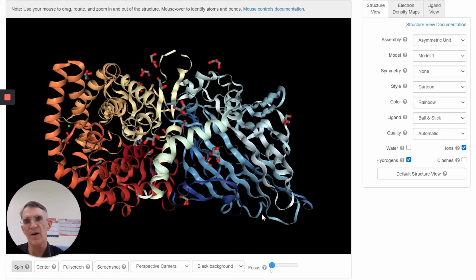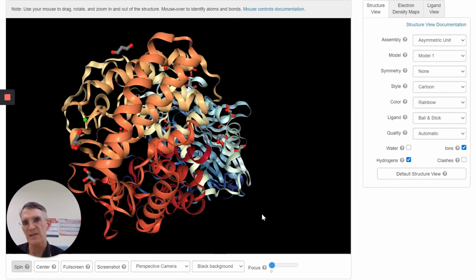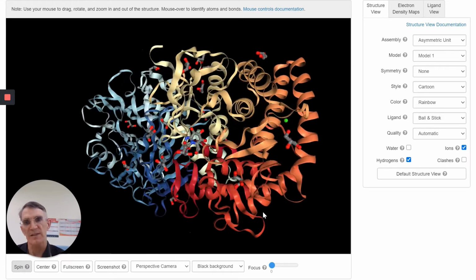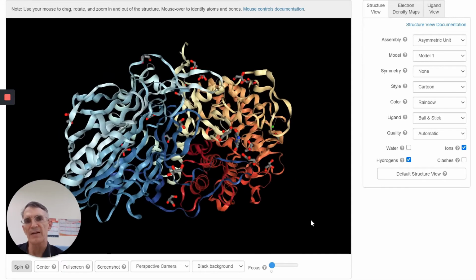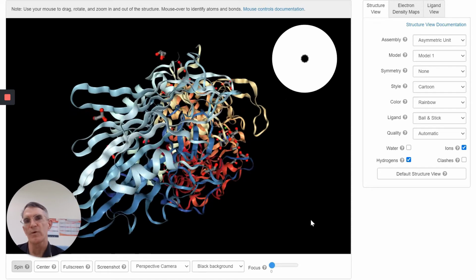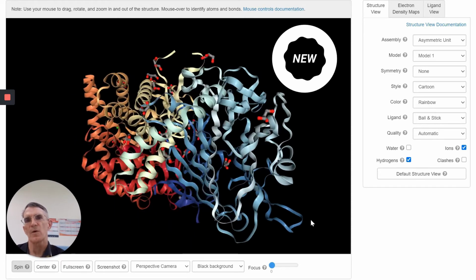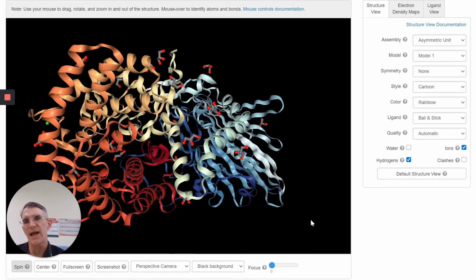So we're involved in natural products extraction, like some organic chemists. We also sometimes want to synthesize the substrate or synthesize inhibitors for our enzymes, and some of those can be applied to things like possible treatment for COVID-19 or other diseases. So we are working on that, and we have chemical synthesis in our lab as well.